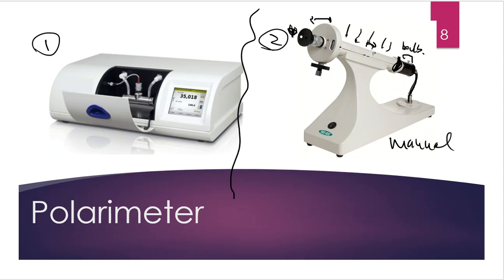So what will happen is that I'll take my fingers and I'll just turn the dial, and I keep turning until light begins to come through the eyepiece. And I see that with my own eyeballs. So in the picture, that was spot number 8 because it was a picture of an eyeball. So I am the detector of that instrument, and I tell that instrument when to stop. And I take my hands off of the dial because that's when I tell the instrument when to stop.